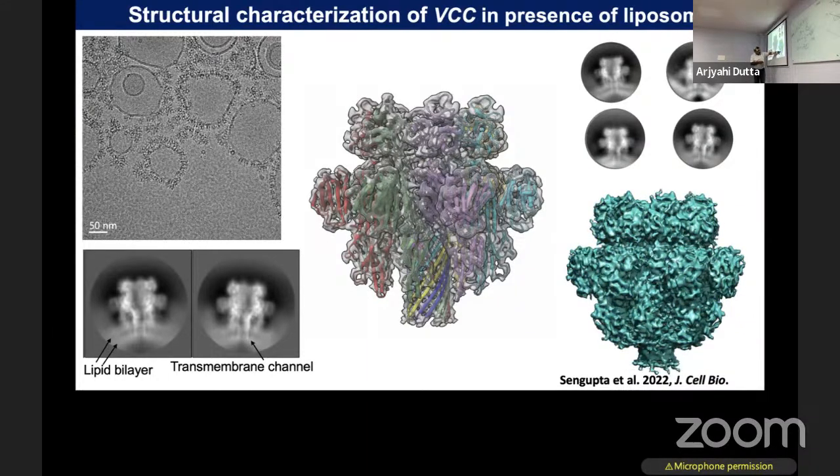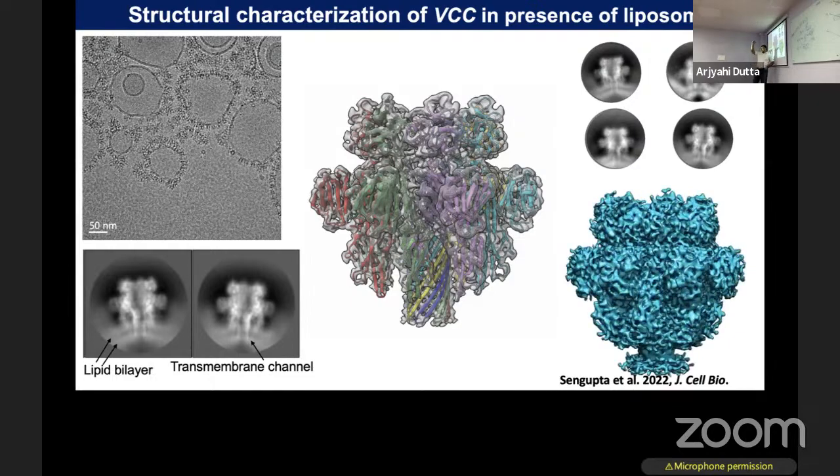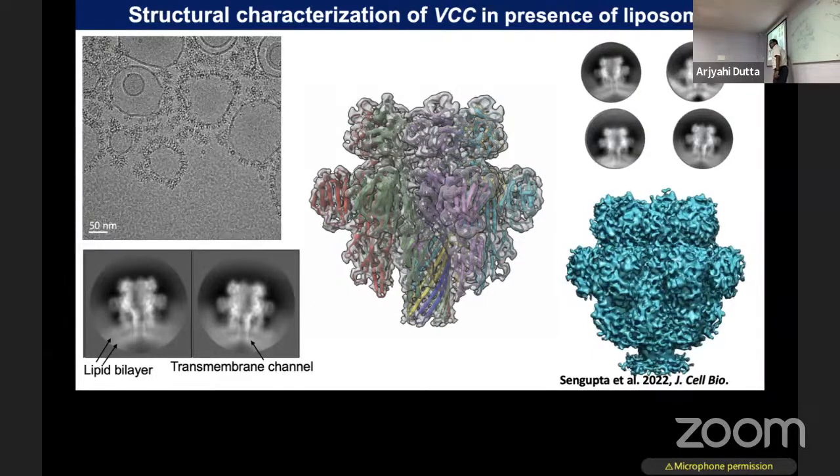Here you can see this barrel part is changing in the presence of lipid. It is breathing. We capture all these barrels one by one. When it is inserting through this lipid, can we capture this? That is one of the main interests for this project. We capture the entire thing.